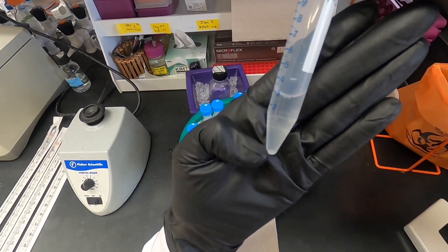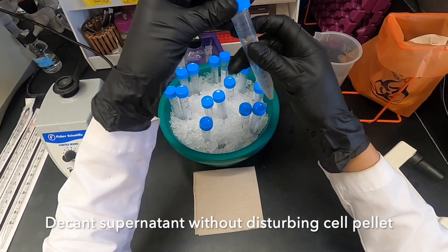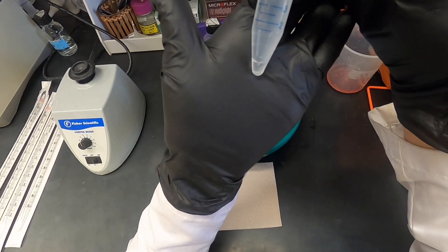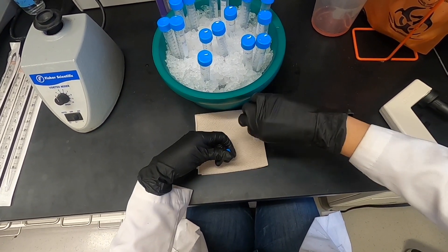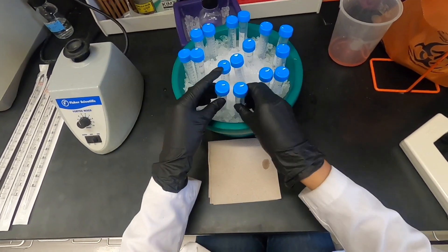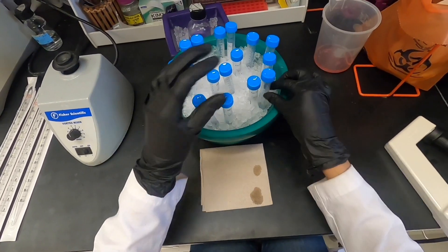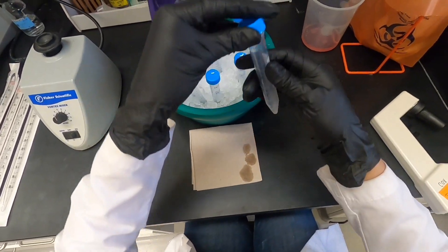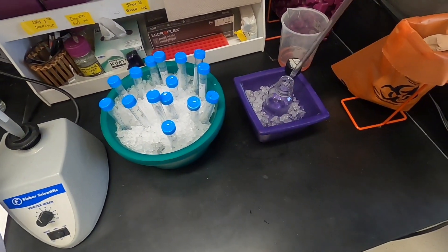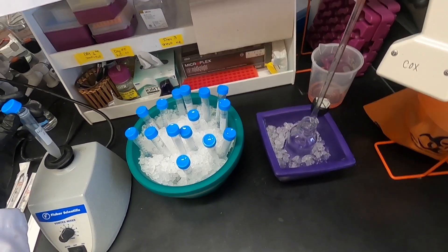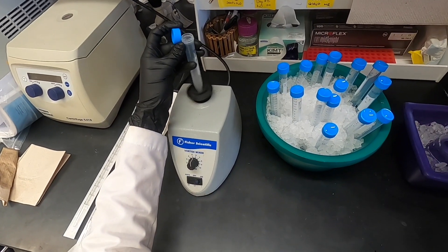Here you can see our cells have once again pelleted and we can easily discard the supernatant by inverting the tube over a waste container. When the PBS has been removed from all tubes, we will proceed to fix and permeabilize with 70% ethanol. It is important to vortex the tube while we add the 70% ethanol in order to prevent aggregation of our cells.